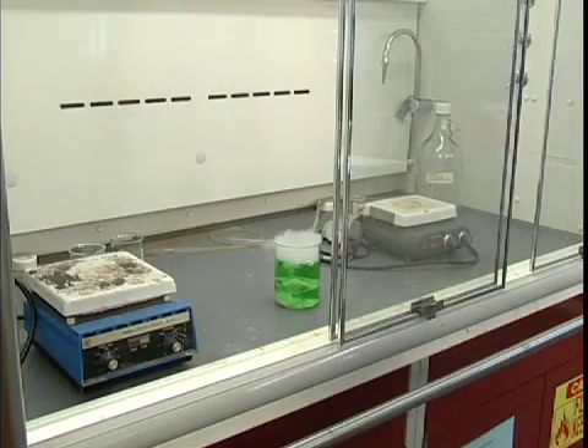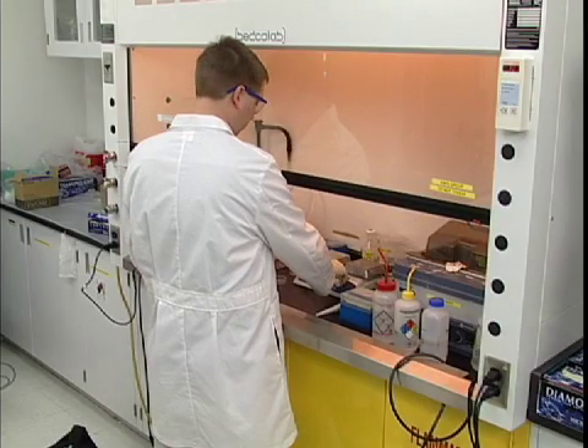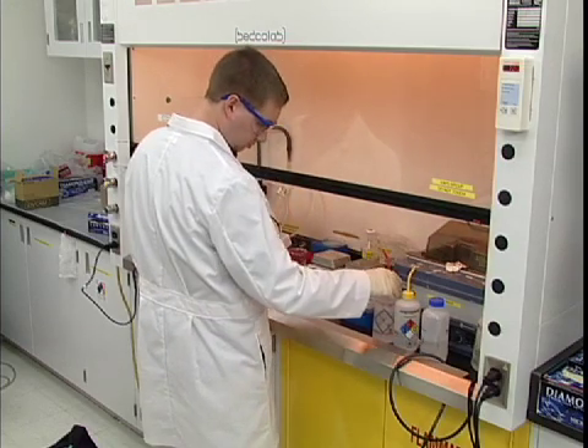Often, this means working within a hood. We can get an idea of how to work safely with hoods by looking at one of the most frequently used types, the chemical exhaust hood.